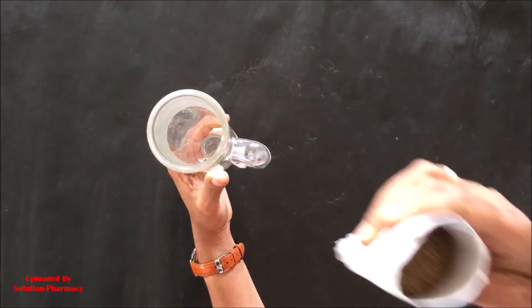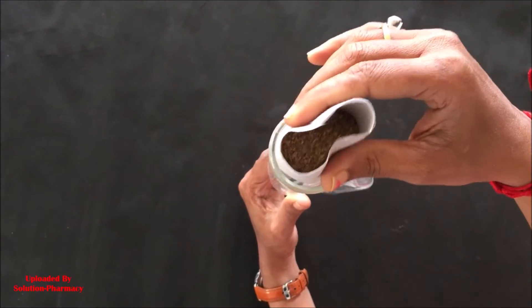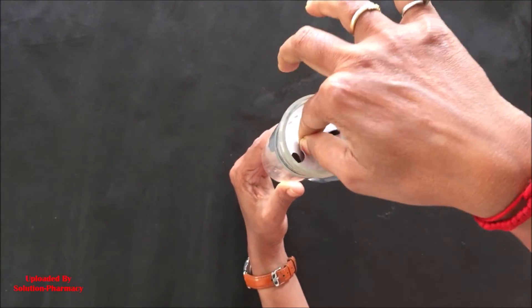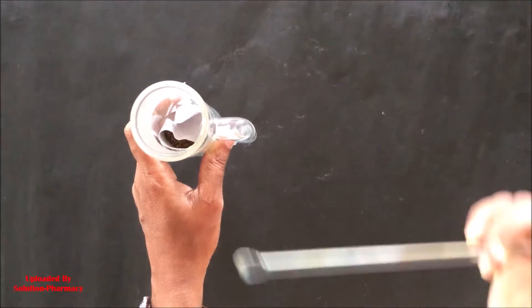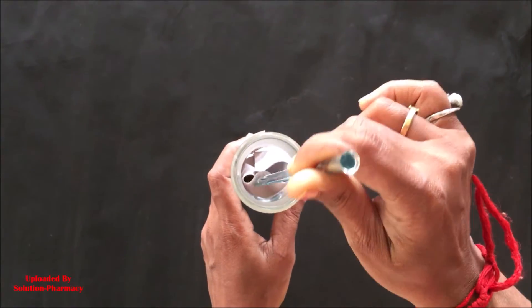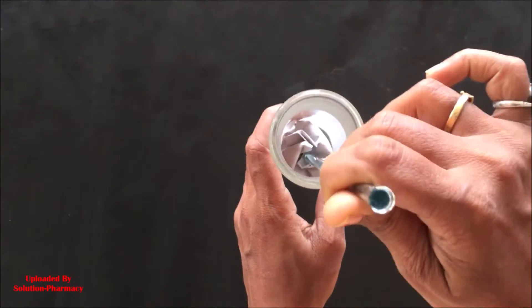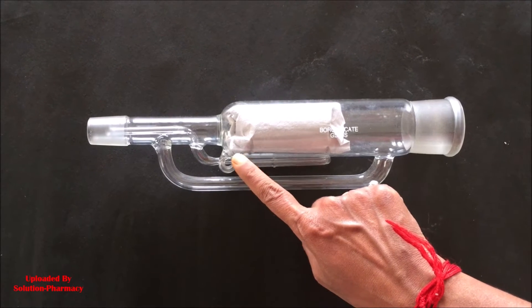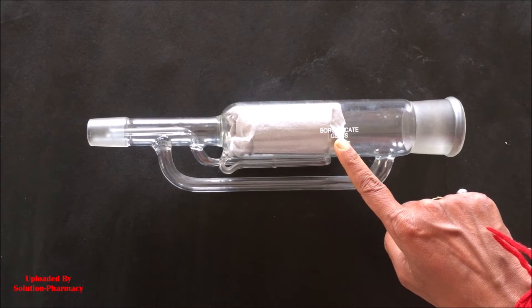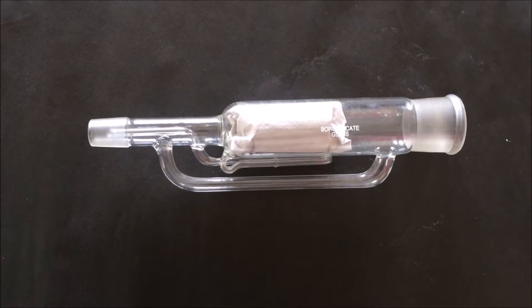There are many types of thimbles available in the market made of cellulose. You can also prepare a thimble using muslin cloth. Now load the thimble containing the powder drug material inside the extracting chamber of the Soxhlet apparatus. After placing the thimble inside the Soxhlet chamber, cover the top of the thimble by folding the extra length of filter paper inside the chamber with the help of a glass rod so that the plant material is completely covered and packed.